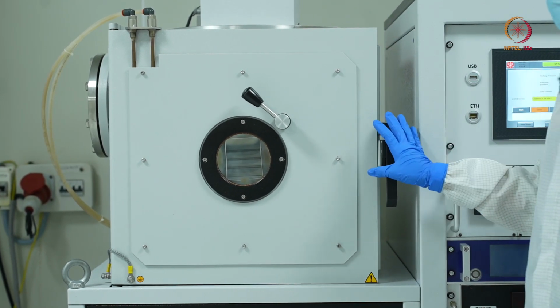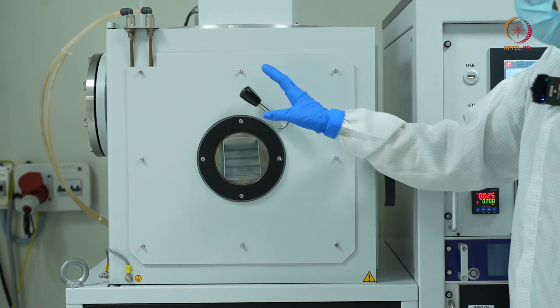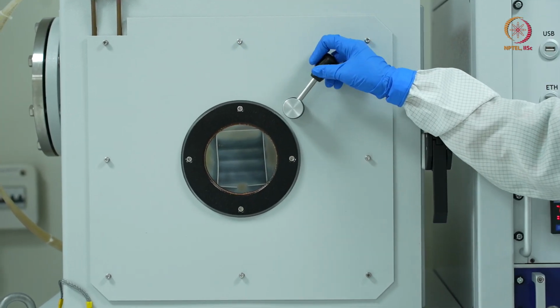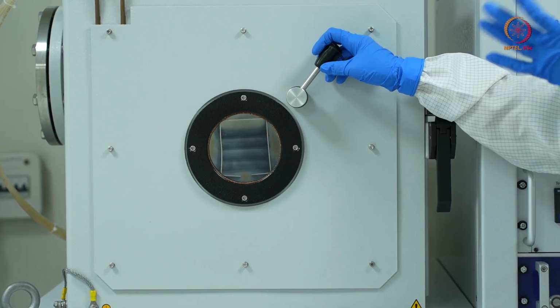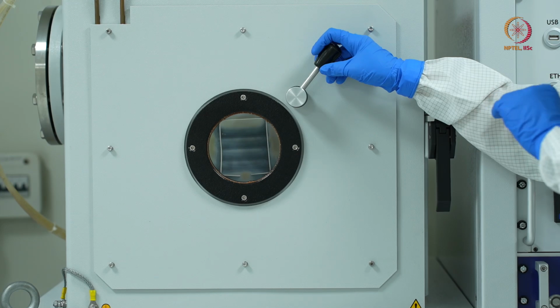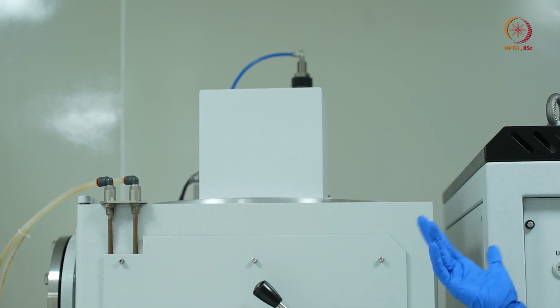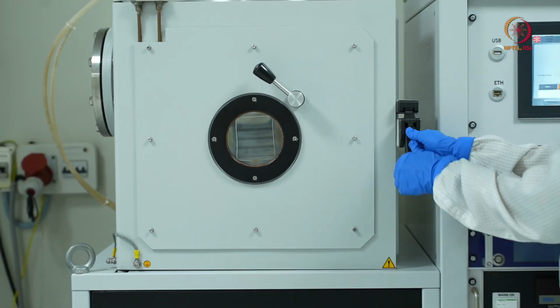Before we open the chamber, let me give a brief of the chamber. This is the viewport, wherein if you want to see whether the plasma has struck, or to see how much deposition, or to see whether the substrate is rotating or not, this is the viewport from where we can see. This is the motor control for the substrate holder to rotate. Now I'll open the chamber.